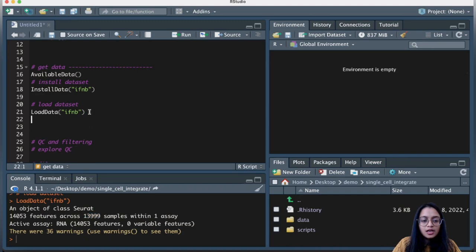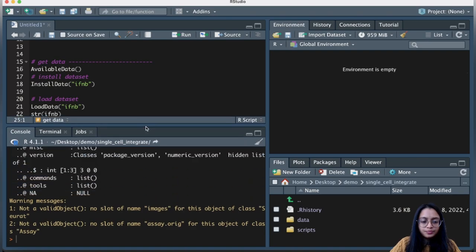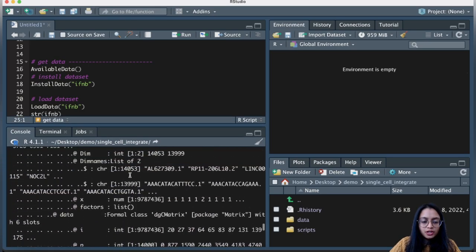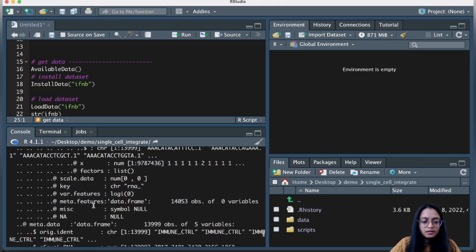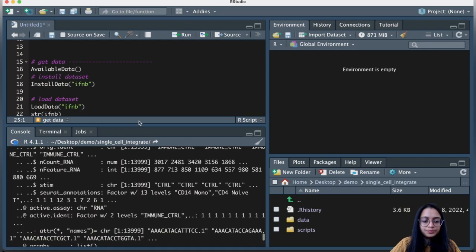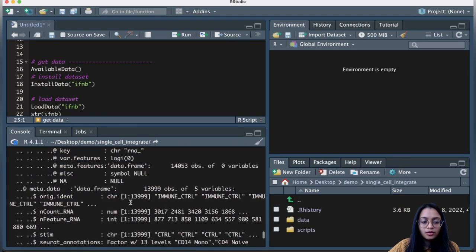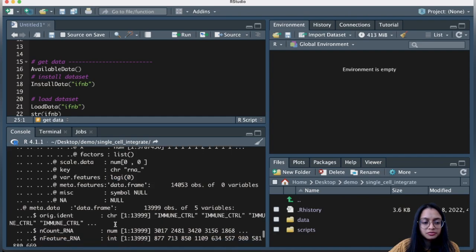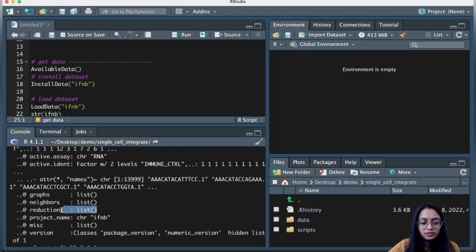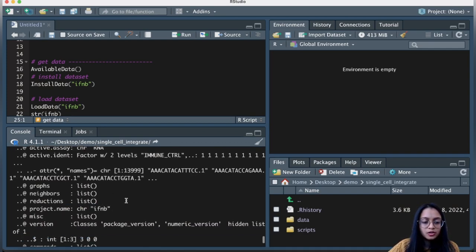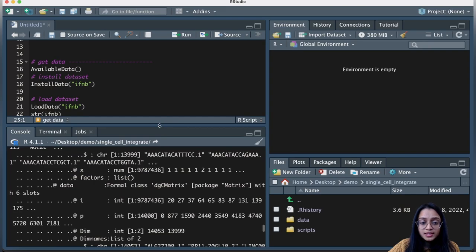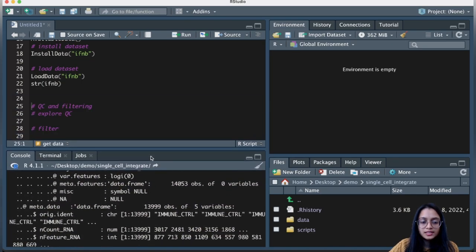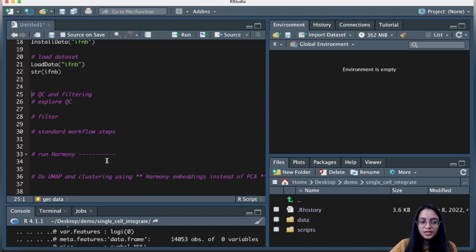To load the dataset, we type LoadData with the dataset name. This is a Seurat object containing many features and cells. Looking at the structure with str, we can see it has counts and some metadata. Looking at the object, this data is not processed — there is no data in the scale data slot, no variable features identified, and no dimensionality reduction performed. So let's start processing the data.